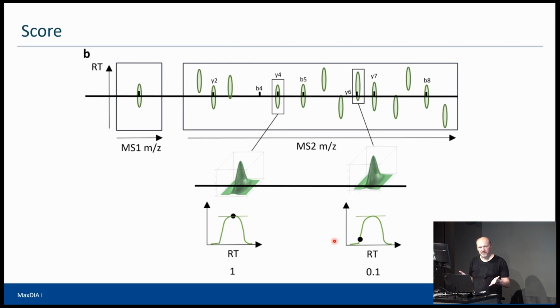And I don't think that's something particular to MaxQuant. That's actually something that Spectronaut is doing all the time already, basically. Okay, so that was the score.